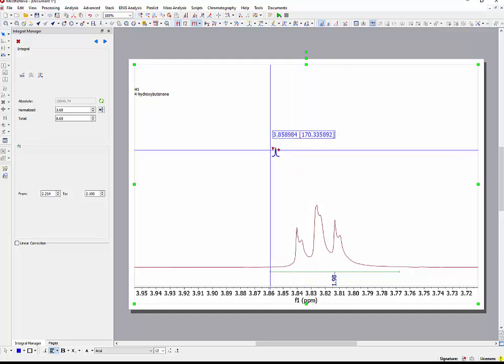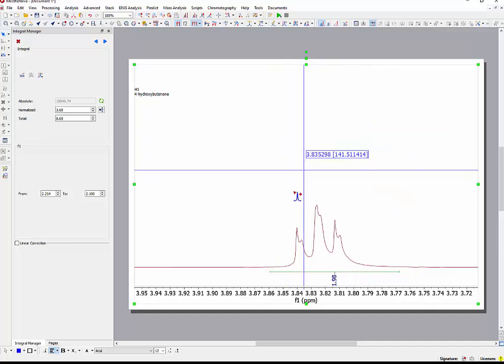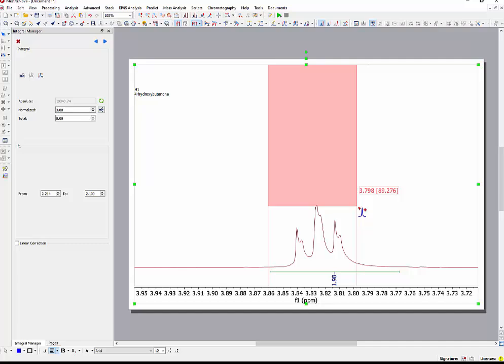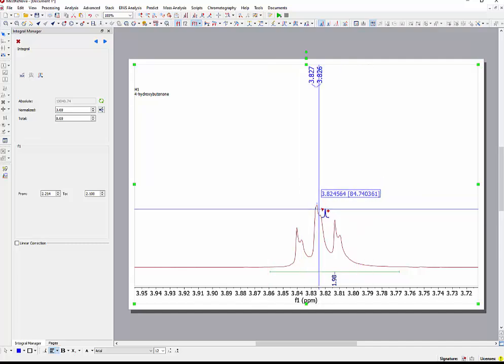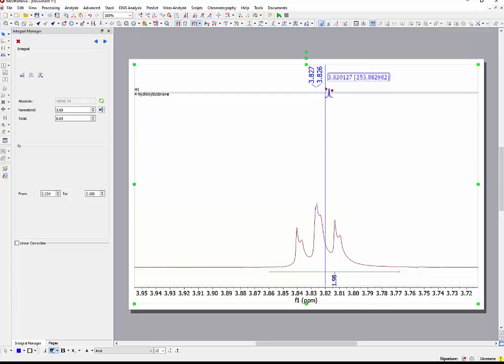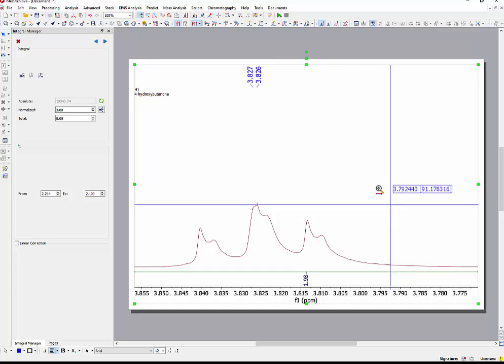K brings up the peak picking tool, and when I have the peak picking tool active, if I go this high up, then I have said that none of these peaks count, whereas if I go this high up, then there's at least 1 peak that will count. And in fact, it's telling me that 2 peaks count. This is a real peak that I like. This one, not so much. It's a bit of a shoulder, and I don't believe that that is actually a real peak.